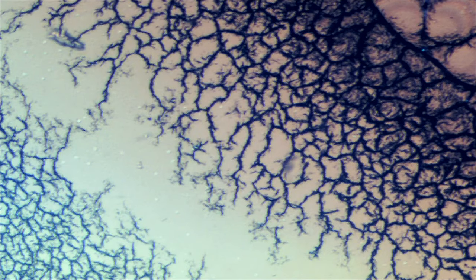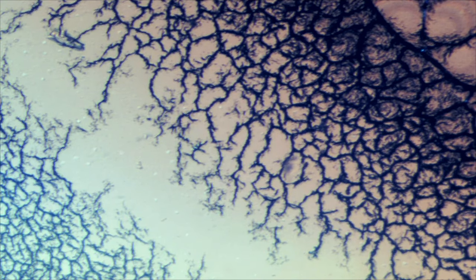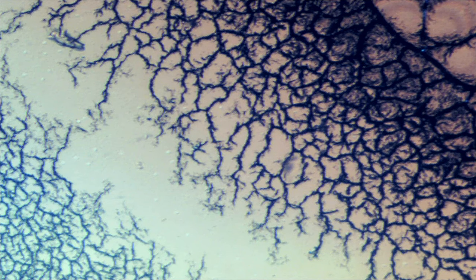I think maybe it would be like slow gradual movement, or maybe we're just not able to get that super zoom in that we need. Let's go ahead and switch to the dried human blood. Alright, I got the slide on of the dried human blood and we're going to go ahead and zoom in on this using the first zoom.